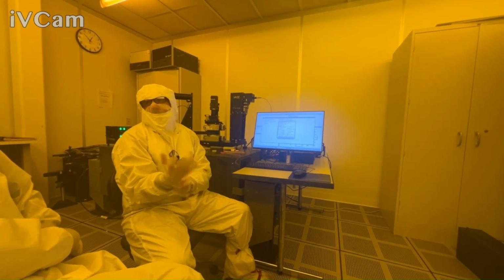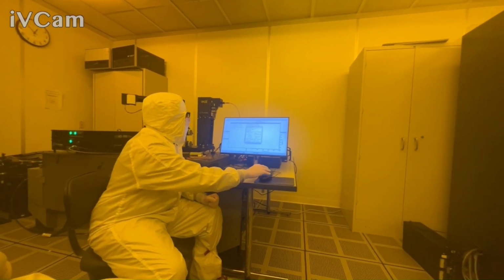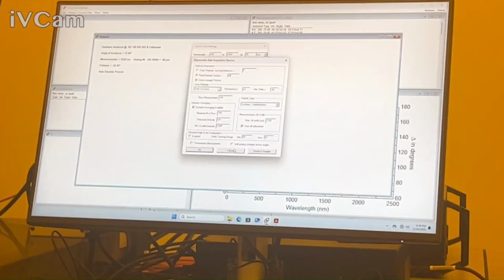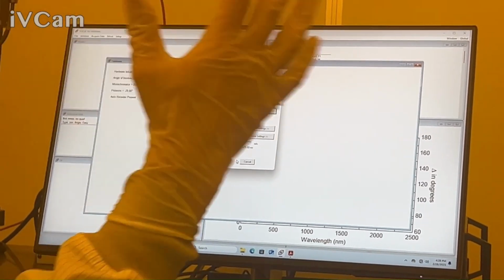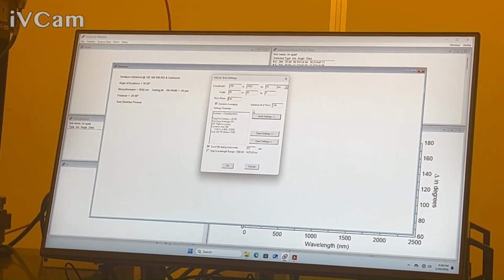Again, if you have a sample, I'm dependent on the thickness and other things too. So that's the other one. So during an install, I'm checking those two things, and then after that, it's just whatever we want to do for fun. So that's the same.